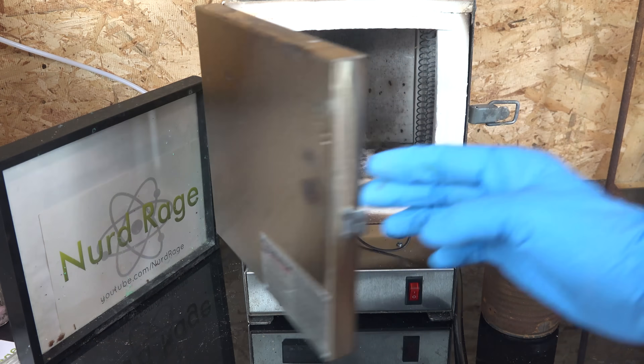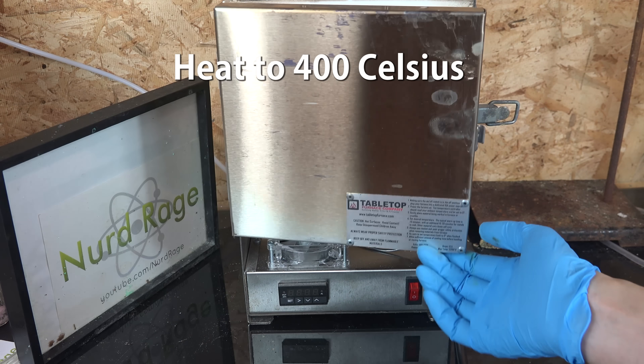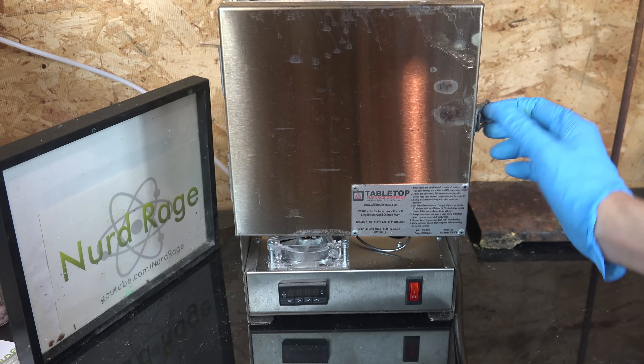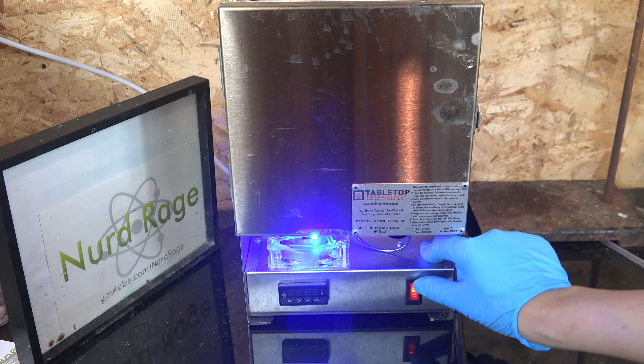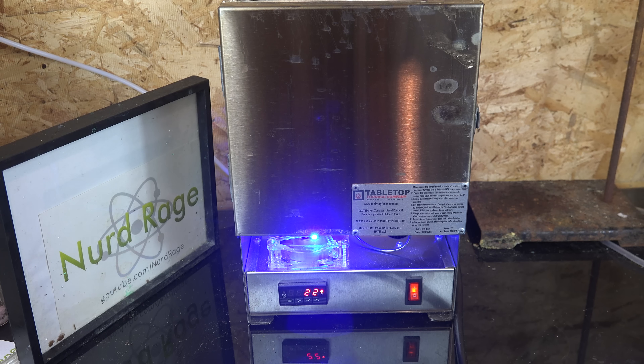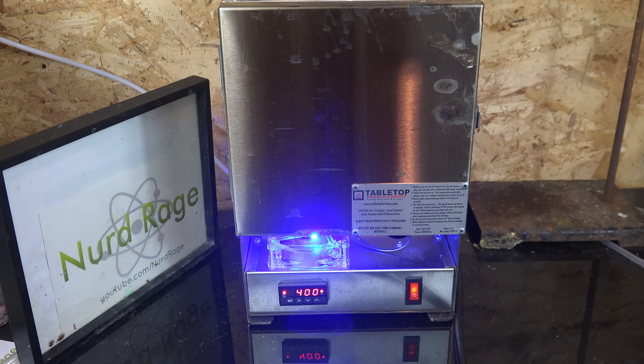Place the can in a furnace and heat to 400°C for several hours. You don't need an oven furnace though — heating for 10 minutes with a propane torch until it's red hot seems to work. Other amateurs have simply heated the can on a gas or electric stove with good yields as well.